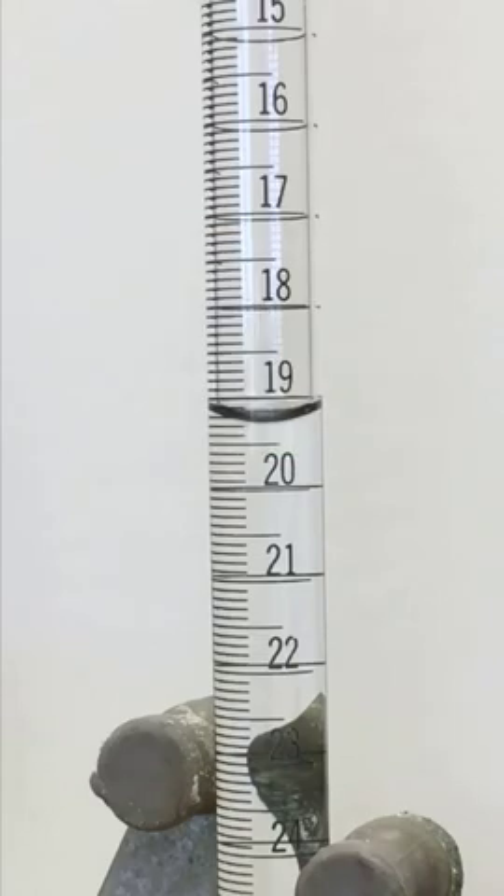When you read a burette, you're going to read from the top down. So we read from the top down. So this is 18, 19, 20.